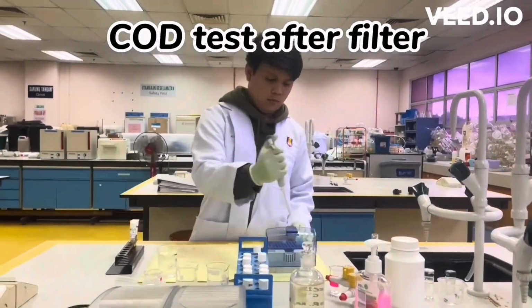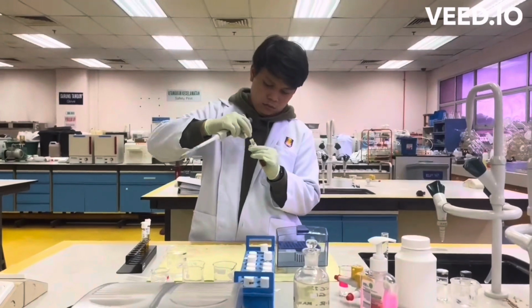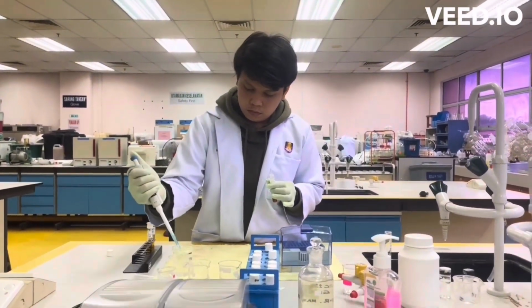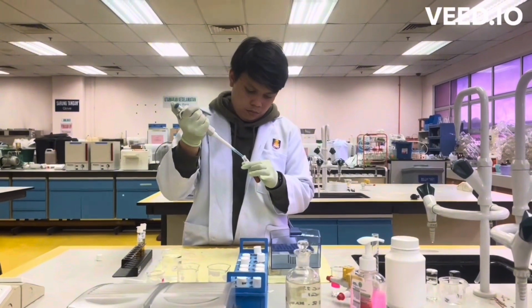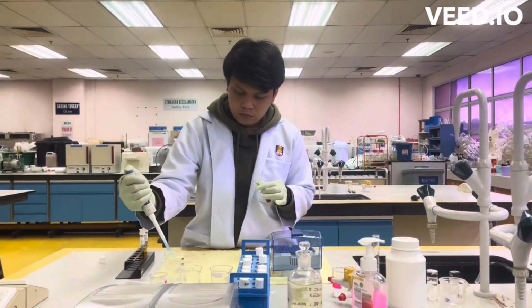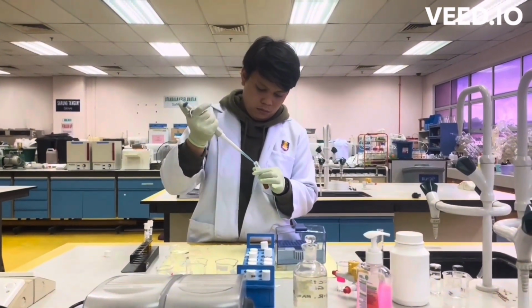This is the COD test after the filtration of water. First, we are going to preheat the COD reactor to 150 Celsius. And then we are going to use 2 vials, with one vial filled with distilled water and another one filled with the sample water. These samples are filled 2 milliliter each using a micropipette. And then the samples will be inverted, so there will be a chemical reaction between them.